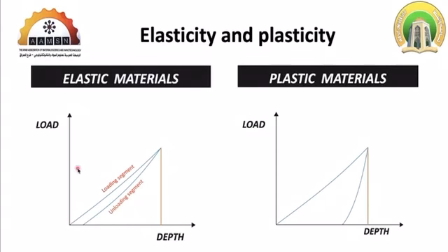As mentioned earlier, everything is recordable and done under fully computer control. When we push the indenter to penetrate the surface, we will have increasing depth with load.